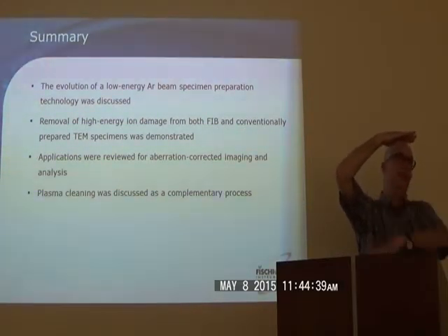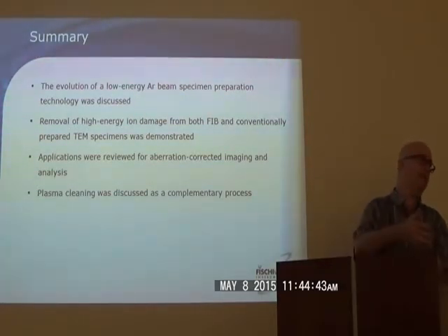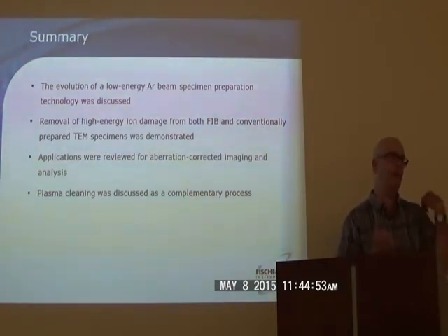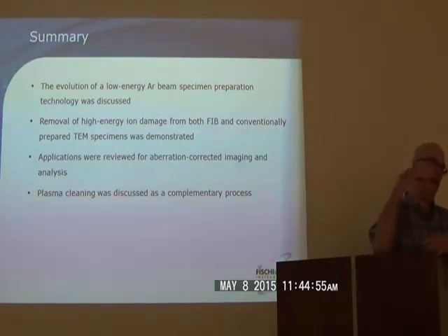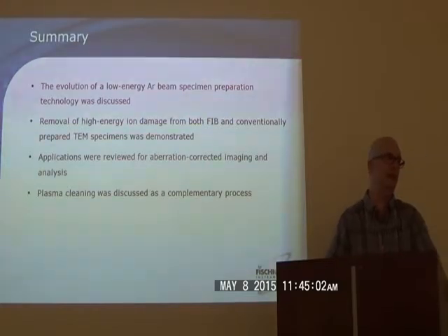For the NanoMill, true, unless you take the sample out of the NanoMill, go to TM and make a measurement, you don't actually know where you are in the process. So hence, it gets difficult sometimes for us to quote times. We know generally at the time, but as I mentioned during the talk, it really depends on how thick the sample you have, and you have to kind of predict where you want to end up based on experience.